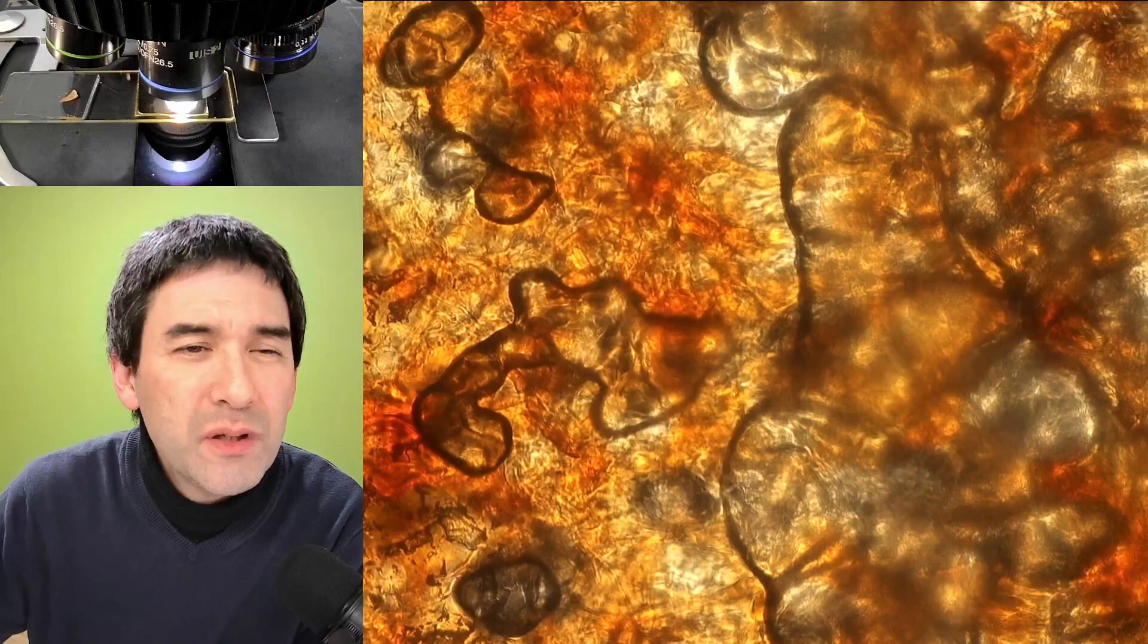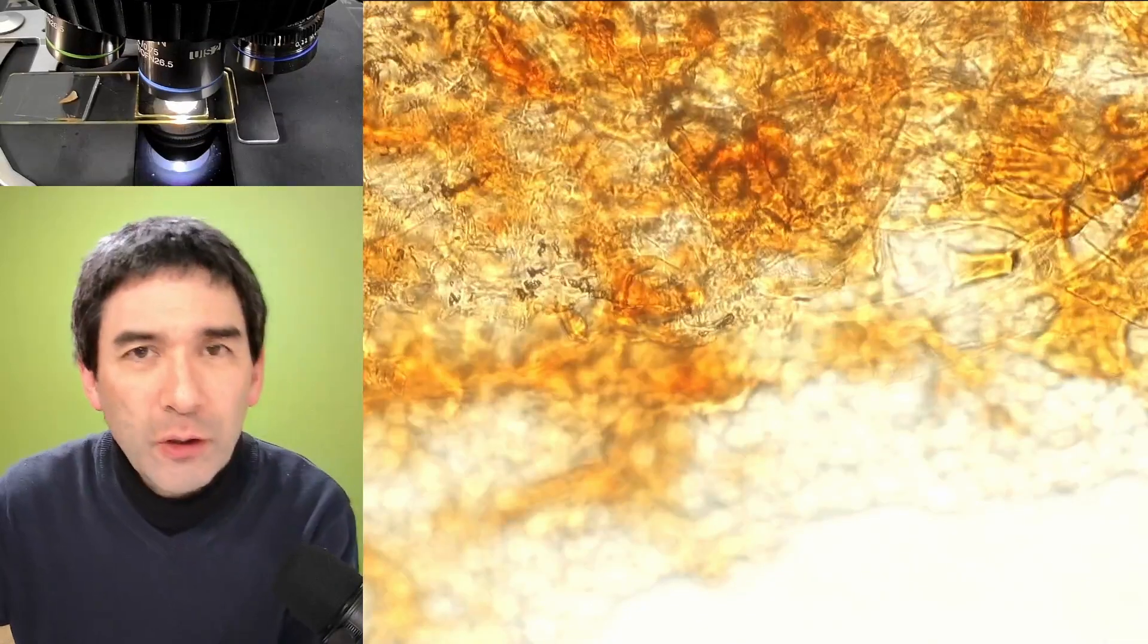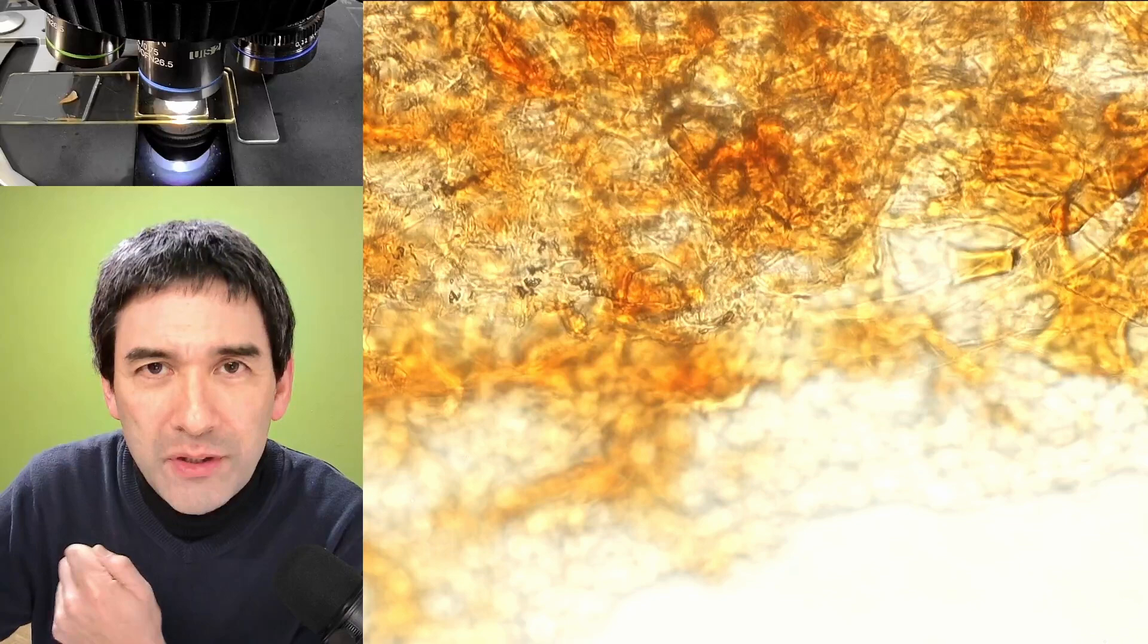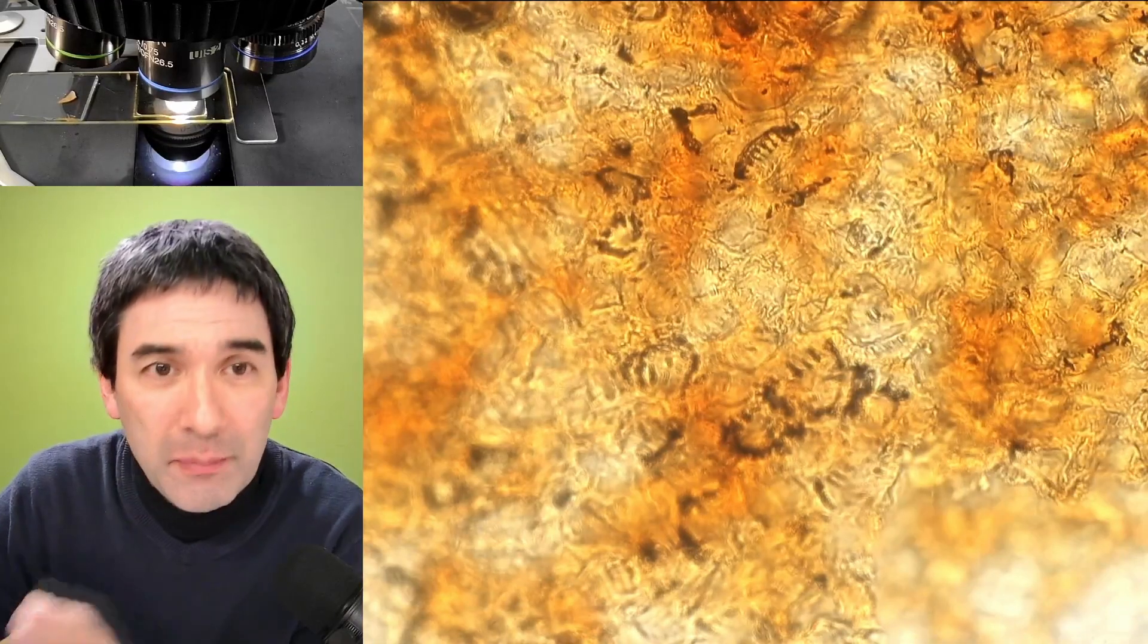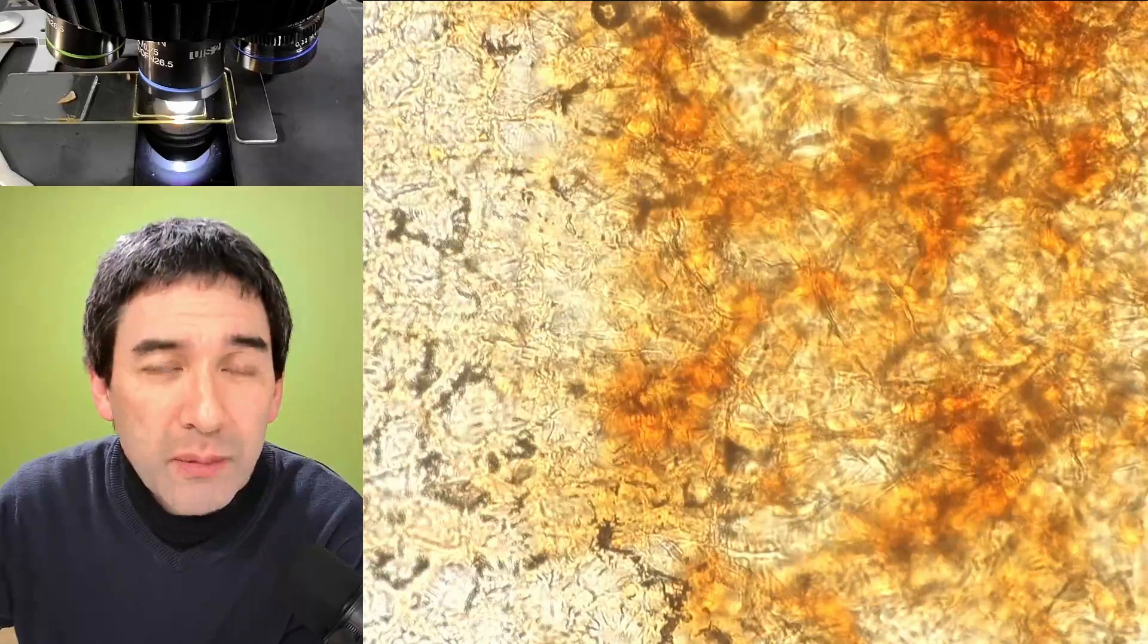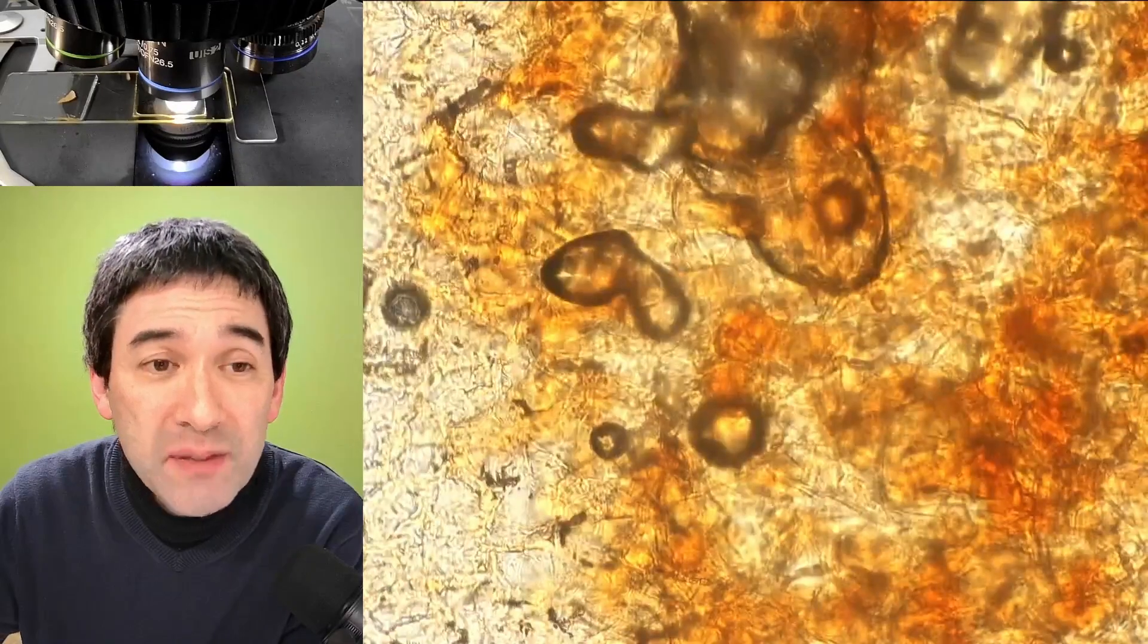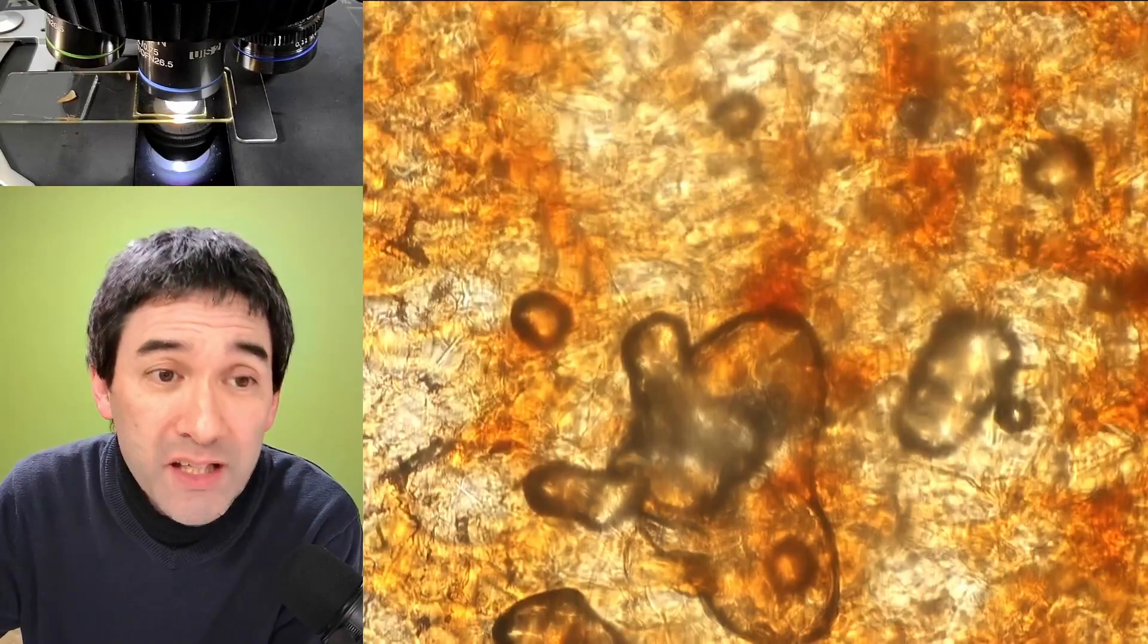But the idea is the following, that if the mounting medium is compatible with the specimen, like for example it is in this case, then essentially the mounting medium will brighten up the specimen significantly to the extent that the light is able to go through and then we're able to observe the specimens much better.